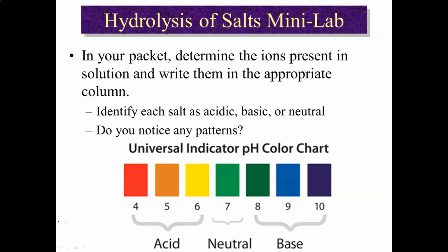What we're going to do right now is take a look at the Hydrolysis of Salts mini lab you guys completed in class. And we're going to look at how we determine why those different salts you dissolved were either acidic, basic, or neutral. So most students think of salts as just being something neutral, like NaCl, table salt, isn't acidic or basic. But as you saw in the lab, when you dissolve those in water, some remain neutral and had that green universal indicator color, and some of them were acidic and some were actually basic.